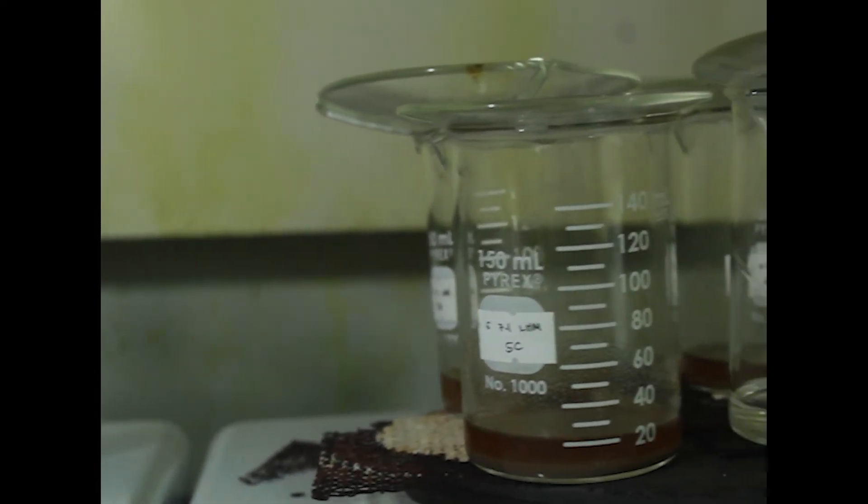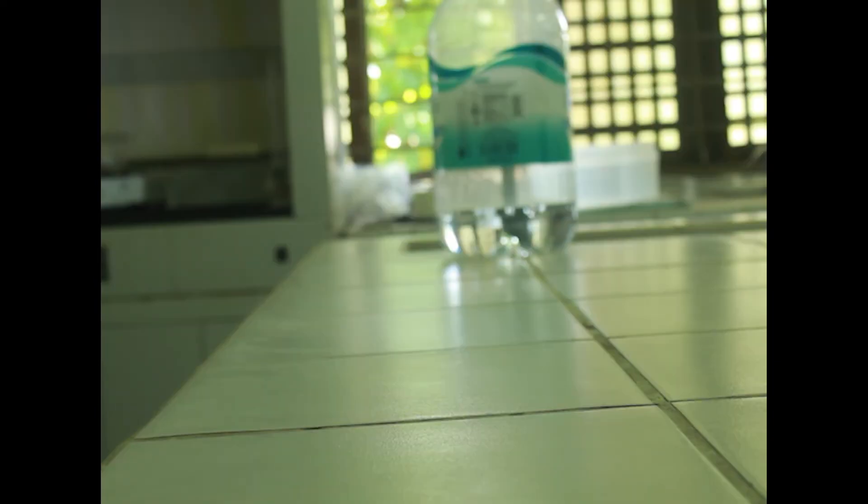While waiting for the reflux time to end, I pulverized my samples that were previously dried while listening to free online webinars.